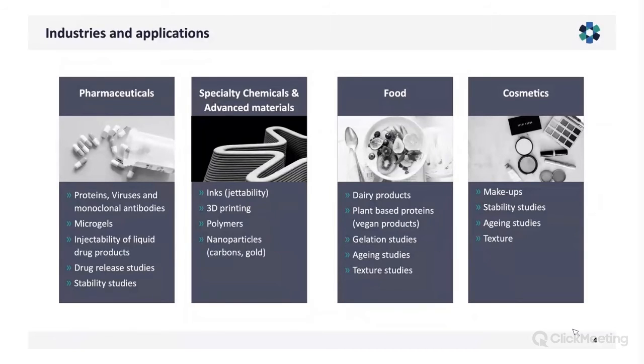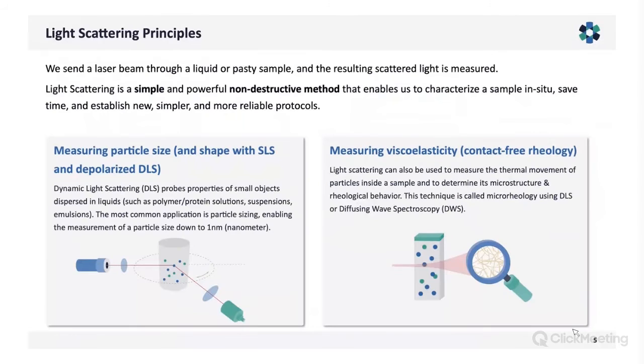All these materials, a whole slew of materials, are structured on the nano and mesoscale, and therefore we wish to understand how these materials are built up and how we can characterize the building blocks of these materials. Very often these materials are also not super transparent, so we need to address the problem of strong scattering or multiple scattering.